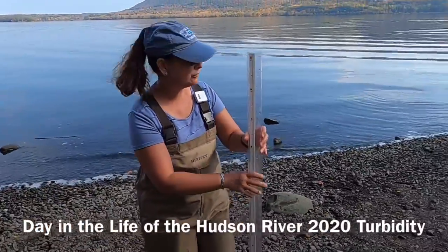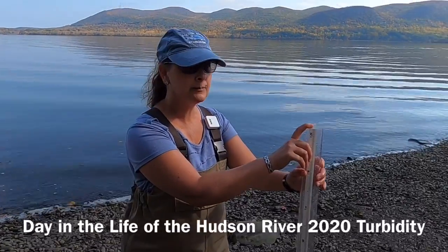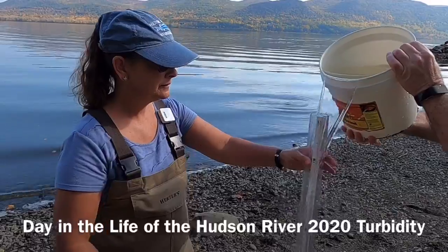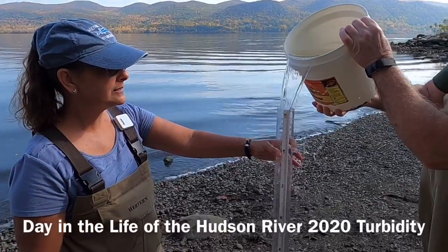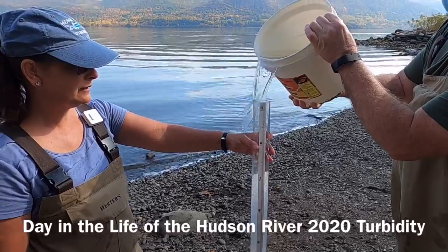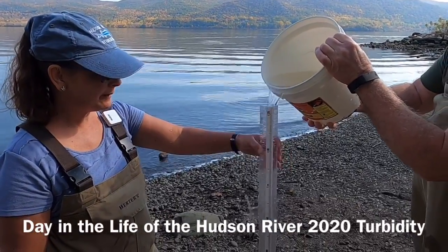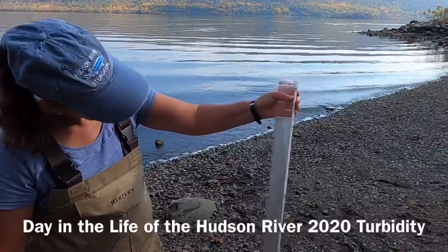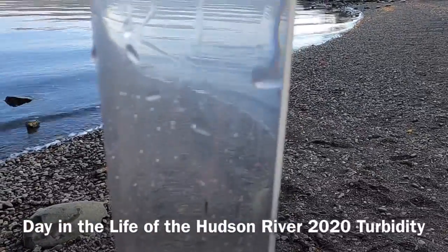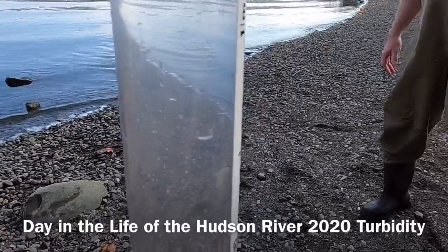So what we're gonna do is pour water that we just collected in this bucket into the tube. You can see it's a little bit messy, so wearing the waders is much, much better. All right, so we're gonna wait for the bubbles to sort of cease. And once those bubbles kind of clear up, then we'll be able to do our sampling.